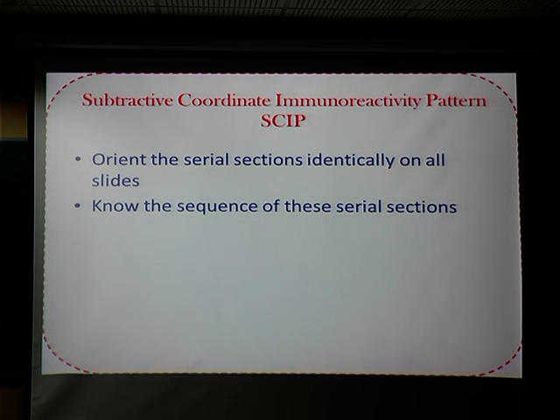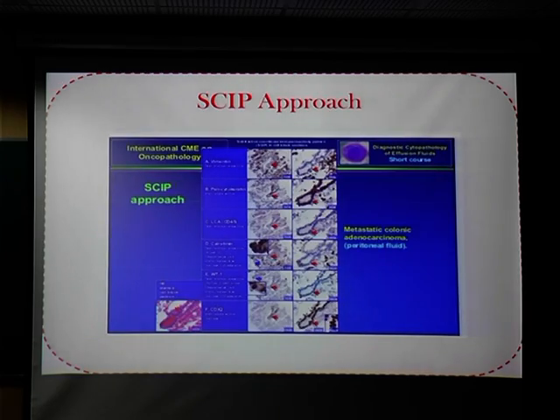which has been described by Dr. Vinod Siddham in one of his books, and he was also our teacher with very good experience in cytopathology. Now he says that when you are cutting a cell block, you need to place the sections very serially, one after the other, so that you can locate the same group or same cluster of cells on the slide and go on applying one marker after the other and interpret in a mathematical manner.